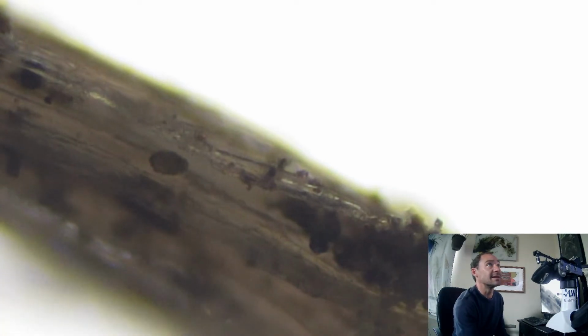But you can see, even in bright field, you can see some fungal hyphae strands in there. It's not as easy to see, but it's cool to see it in two different lighting systems to confirm what you are looking at, to make sure that, oh yeah, that's definitely not part of the plant. That's fungi in there. It's not just something glowing.